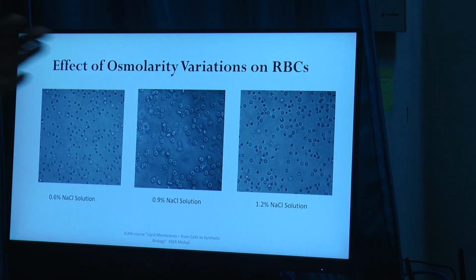And this is what we are going to do in the lab today. All of us are going to take different concentrations of salt solution. We are going to put the red blood cells in, incubate for some time, and then see, depending on the concentration of salt in the solution, how it is actually going to affect the red blood cell.